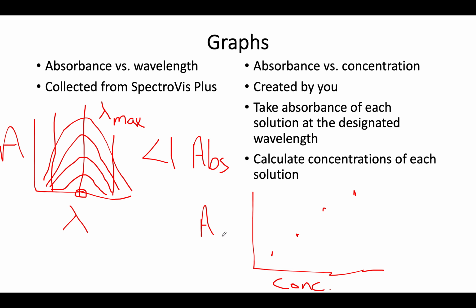Please note, this absorbance is at one wavelength. So if I choose this one over here, every solution is at that wavelength. What's the absorbance there? What's the absorbance there? What's the absorbance there? That's where that information comes from. Then put your best fit line here.